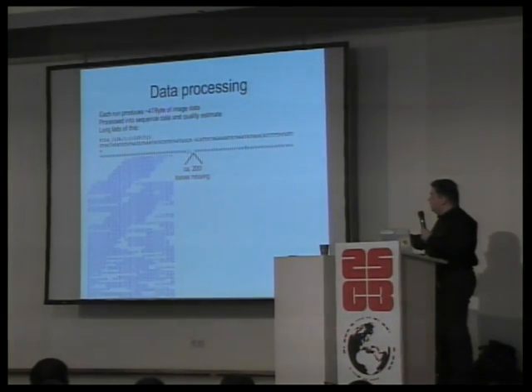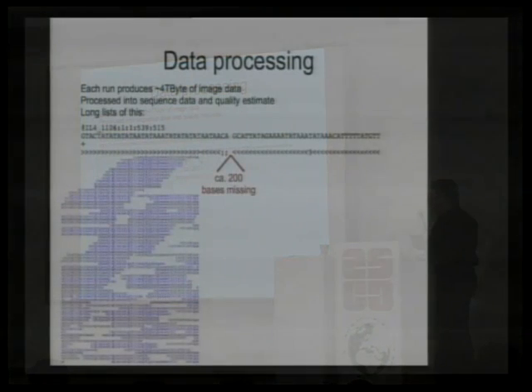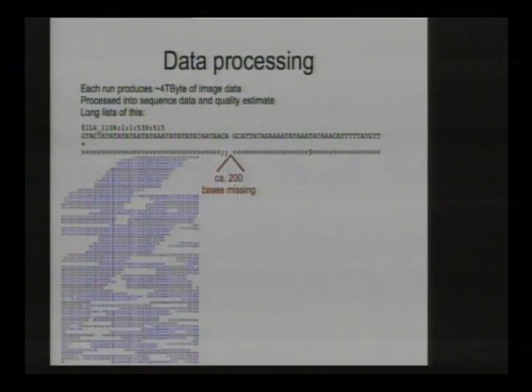So you get lots and lots of lines of this. Each flow cell has 8 lanes, which run in parallel and can carry different samples to be sequenced. And at the moment, I get per lane about 9 million of these.